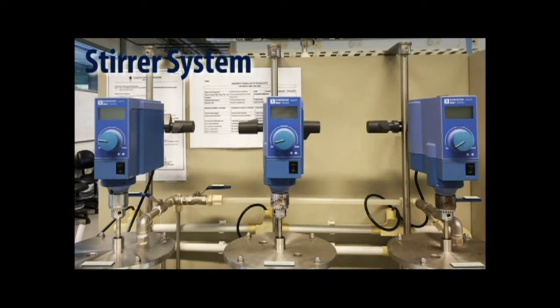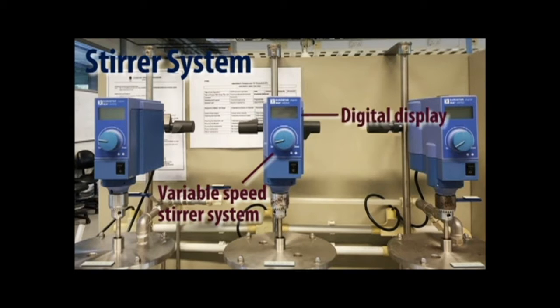For the stirrer system, it consists of a variable speed stirrer system with digital display consisting of a motor and a shaft with impellers made of stainless steel.